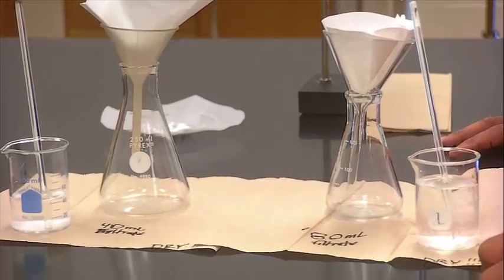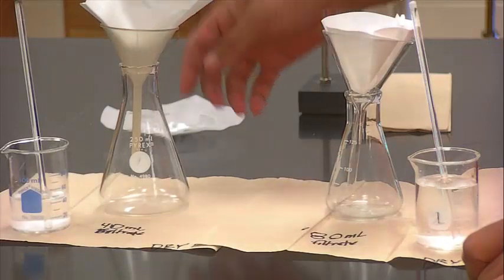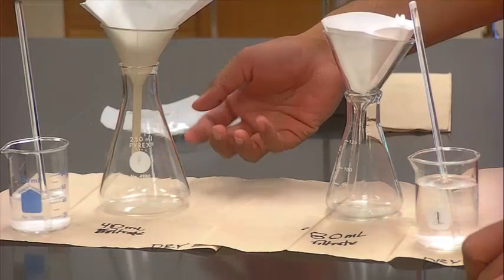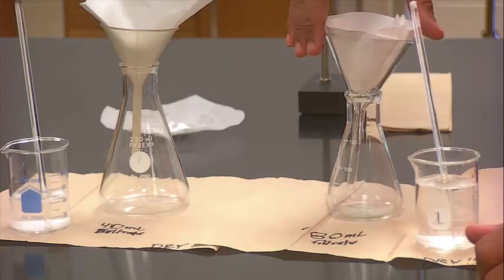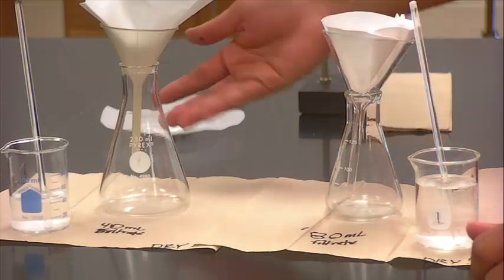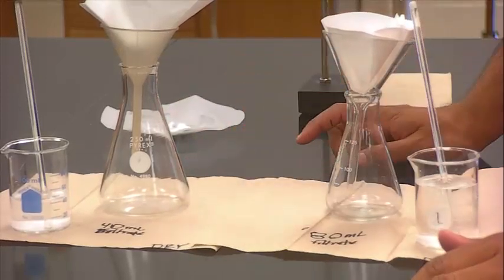Here we put it in 80 mils of DI water. The next step is to actually collect the filtrate. The filtrate is the stuff that comes at the bottom. Now in your protocol, the collection receptacle was a beaker. I just used an Erlenmeyer flask. Basically anything that is convenient or anything that has your funnel that can fit. So in my case, the funnel fit into Erlenmeyer flasks. You can use a beaker, whatever receptacle you will use to collect the filtrate.